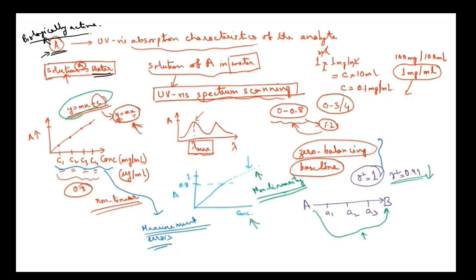However, if you want to extend it to other analytes, even those which are insoluble in water, you just have to change the solvent from water to that solvent. So you can generalize by replacing water in my lecture with solvent.